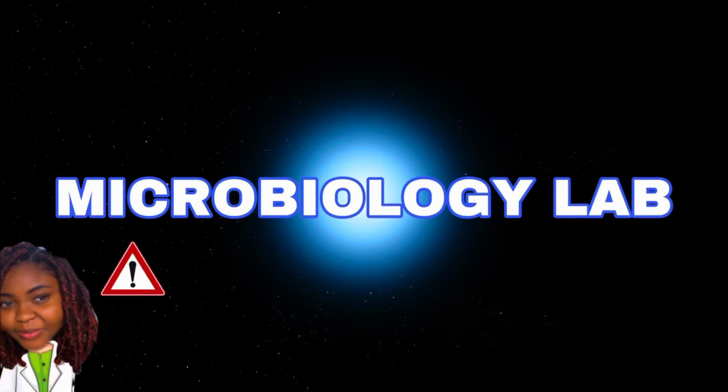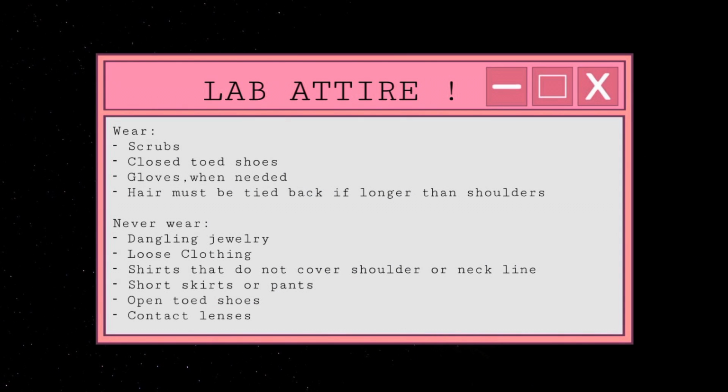So for the microbiology lab, oh, it looks like we're getting a message from Dr. Anecia. It looks like Dr. Anecia was warning us about lab attire. In the lab, you must wear scrubs, closed-toed shoes, and gloves when needed. You must also tie your hair back if it's longer than your shoulders. All of these things protect you from dangerous or infectious organisms in the lab.